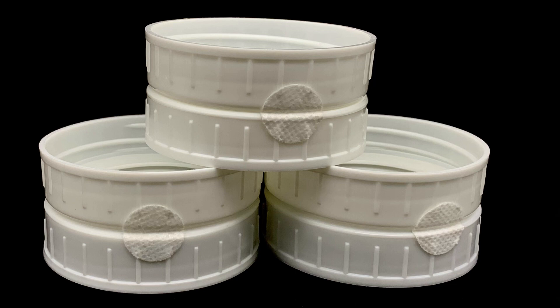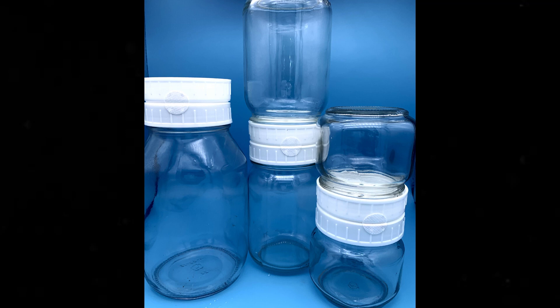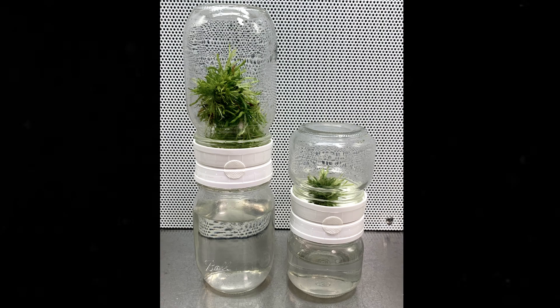It is a unique patent-pending device that simply couples together two regular mouth canning jars. The plants are placed on the upper jar while the liquid media is filled to about two-thirds capacity of the lower jar.